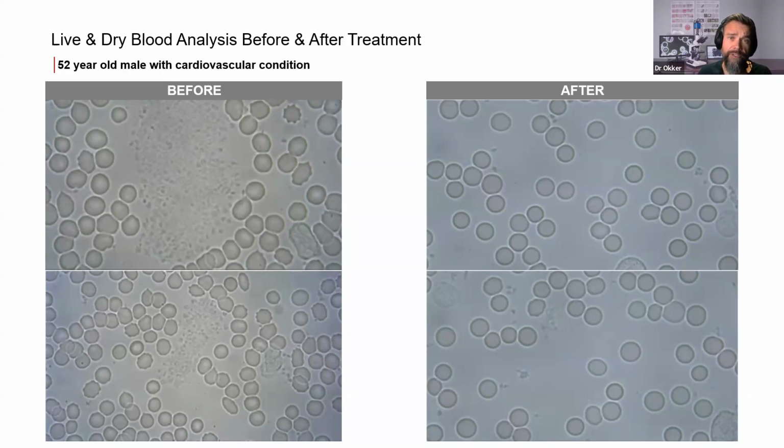So in this image on the lower right-hand side, we can see those small gray structures. Those are actually the thrombocytes, and they should lie on their own like that as individual thrombocytes. On the left, we can see that they're all grouped together in one big bunch of thrombocytes. With that thrombocyte aggregation we always look at the size of the group compared to the red blood cells. The larger the group, the more it has negative implications for cardiovascular health.